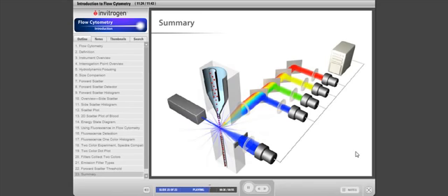4 to 6 color experiments are becoming easier. A few labs in the world are able to distinguish up to 18 colors simultaneously. In the next tutorial, we will talk in more detail about some of the trickier aspects of data analysis that are employed in flow cytometry, especially when 2 or more fluorescent colors are used.